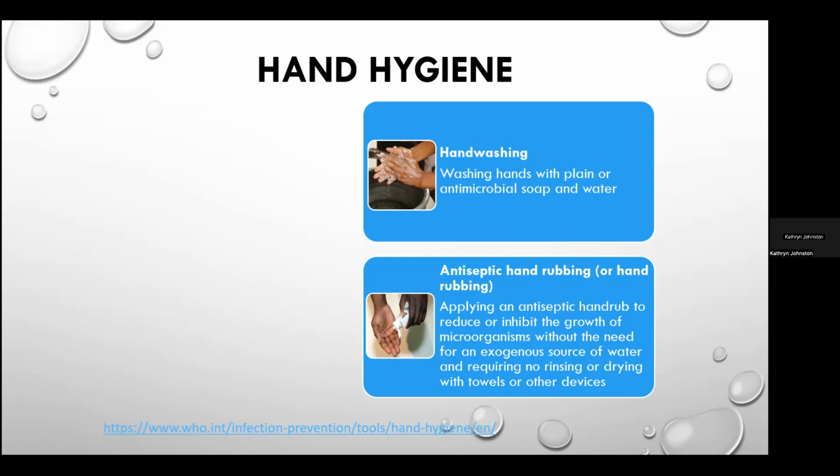The following behaviors should be avoided with respect to hand hygiene: using soap and water and alcohol-based hand products simultaneously, using hot water for washing hands with soap and water, donning gloves when your hands are wet, as this can cause irritation, performing hand hygiene outside the framework of indications, and wearing gloves outside of the framework of indications.